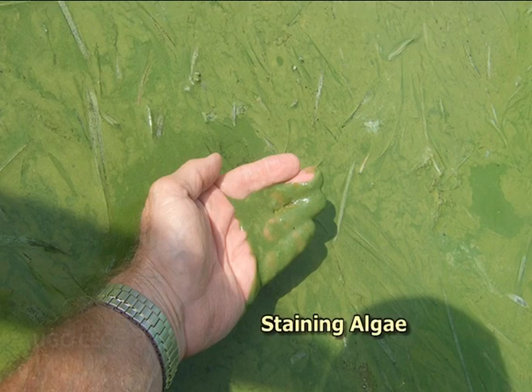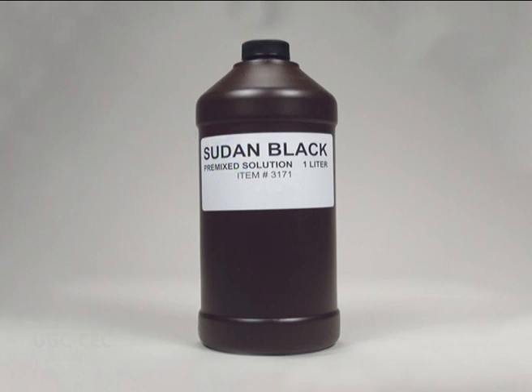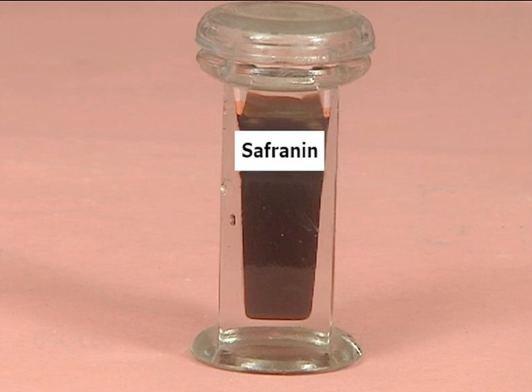Now, method of staining algae. Algal cells can be visualized better with Sudan black B staining. In this method, prepare a smear of algae on a slide, let it dry thoroughly in the air and heat fix it. Flood the entire slide with Sudan black solution and allow the slide to remain undisturbed at room temperature for 5 to 15 minutes. Drain off excess stain and counterstain with safranin for 30 seconds. Wash with water and air dry.